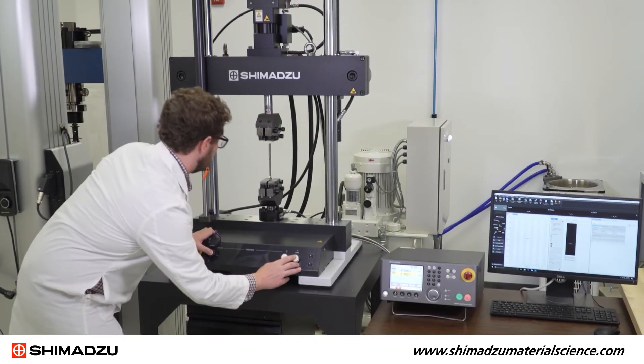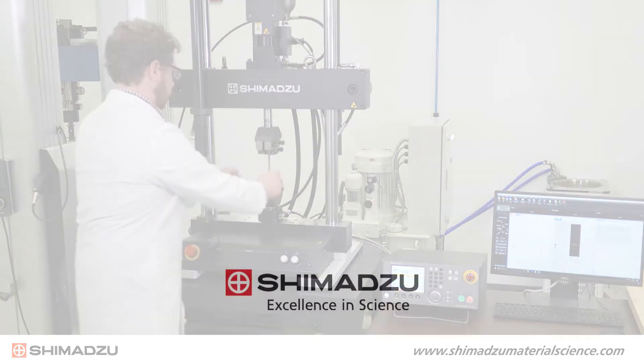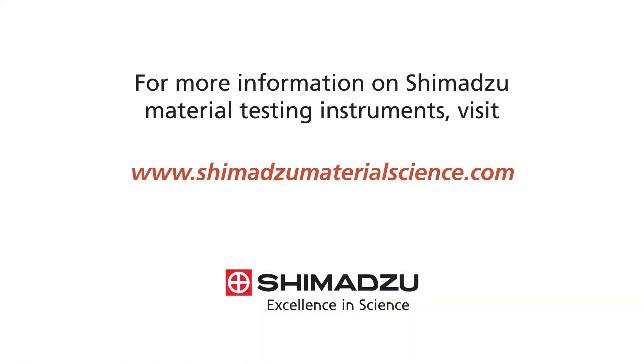You are now ready to use your Shimadzu servo-pulsor. For more information on Shimadzu material testing instruments, visit www.ShimadzuMaterialScience.com. Excellence in Science.